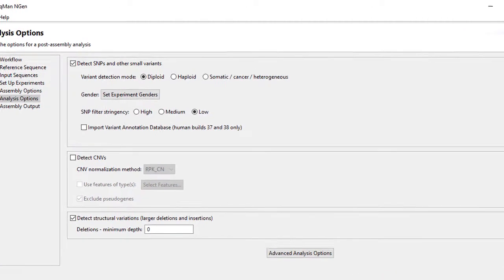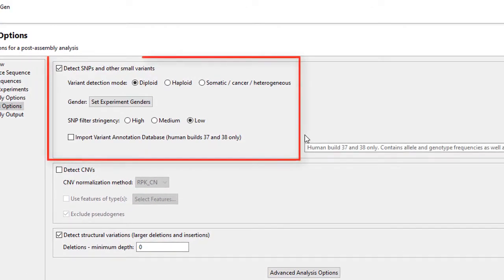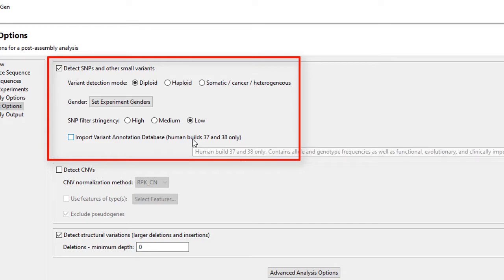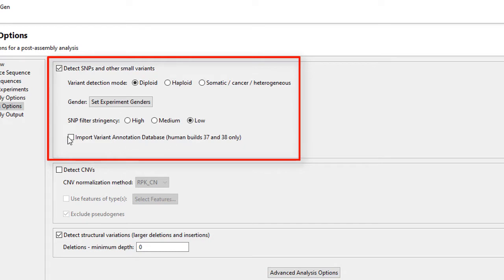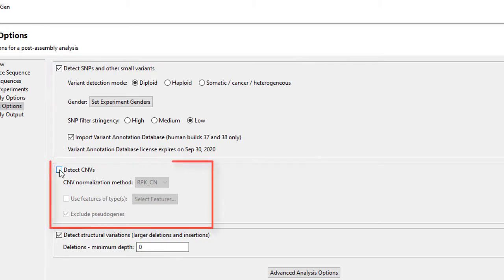In the analysis options screen, set your variant detection settings, and for human data, import the variant annotation database for enhanced variant annotation. You can also choose to detect CNVs or copy number variation during assembly.